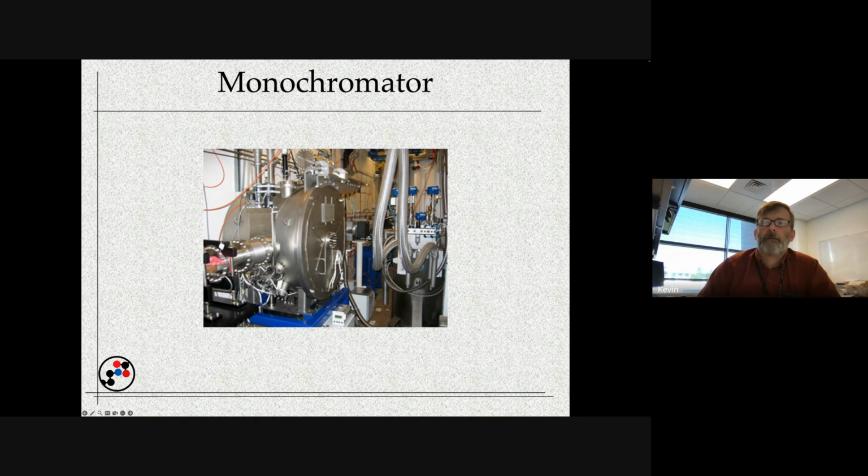To give you an idea, you can get hundreds to thousands of watts of power delivered onto a 5 millimeter square spot on your crystal. So there's a tremendous amount of energy being delivered into this equipment, and loss of cooling power can mean damage to the equipment.